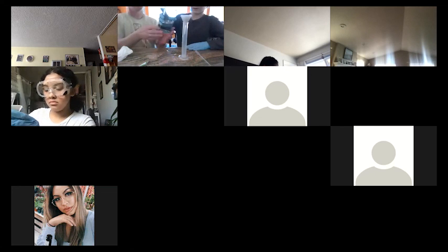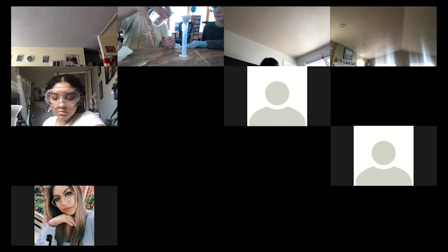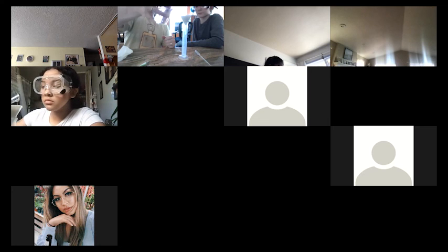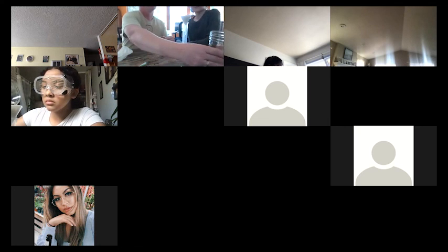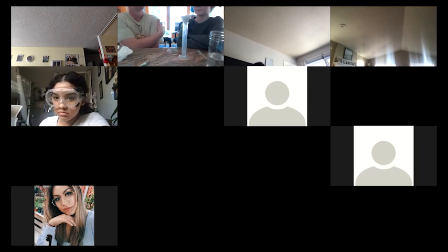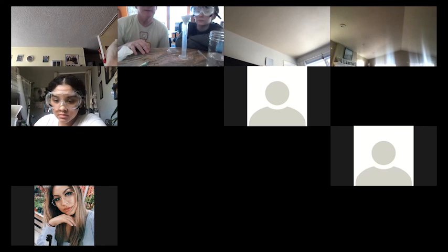Yeah, that's the thing when you're pouring, you got to commit. If you don't, it'll just run down the side. So if you're going to pour, you got to pour. There you go. Luckily, it's filtering pretty quickly. So once you've washed the filter like 2, 3, 4 times, then basically you're done.